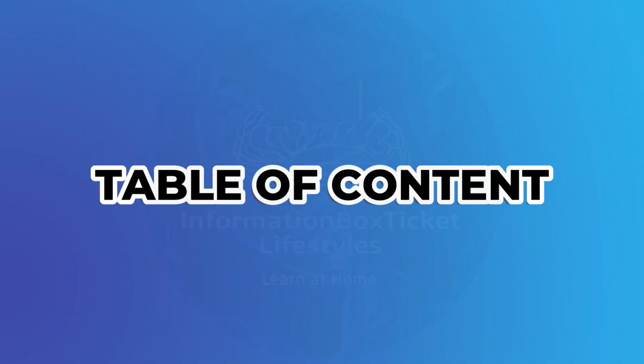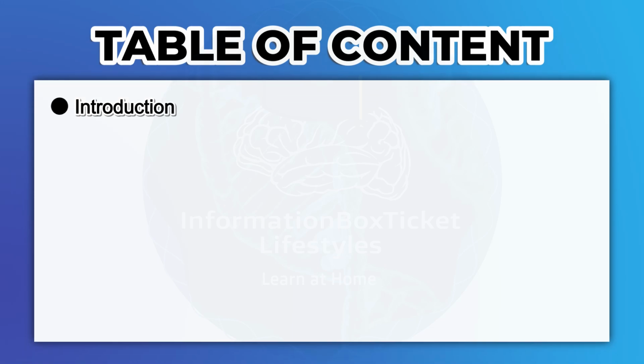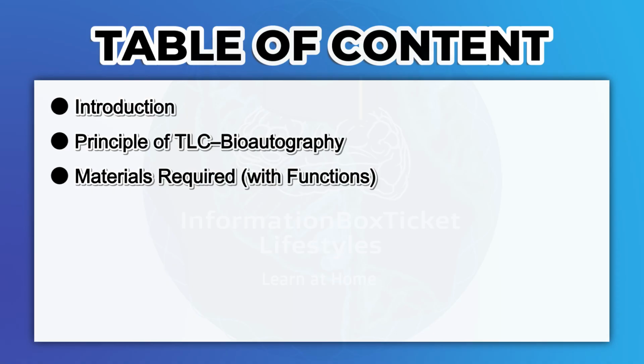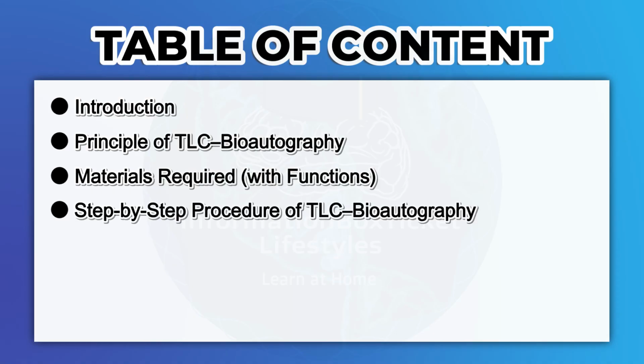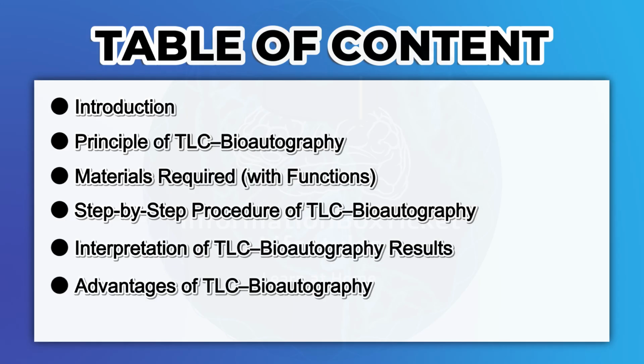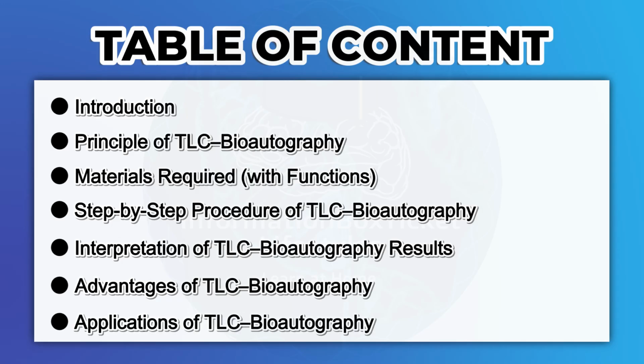Table of contents. Introduction. Principle of TLC bioautography. Materials required with functions. Step-by-step procedure of TLC bioautography. Interpretation of TLC bioautography results. Advantages of TLC bioautography. Applications of TLC bioautography.